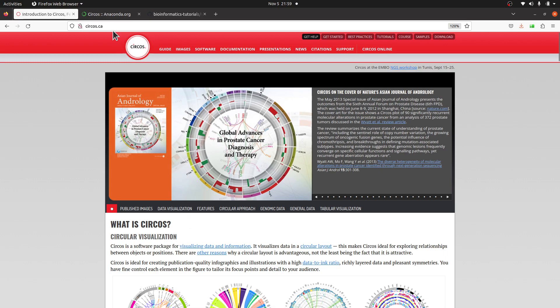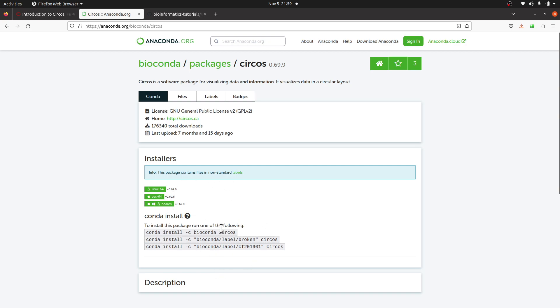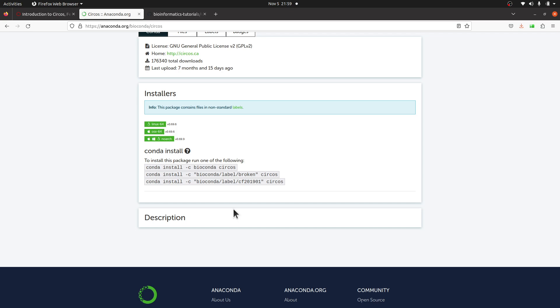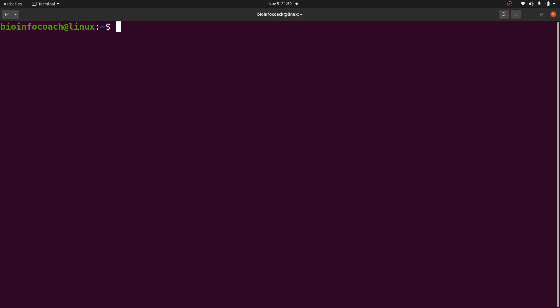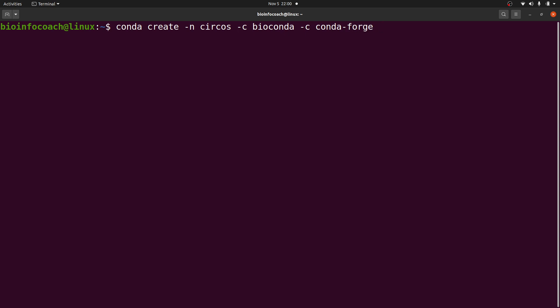Let's move to the instructions for installing. We'll use one of these instructions here. It's very simple and straightforward. Let's go to the terminal and do the installation. I am first going to create an environment and then install Circos in that. So I'll say: conda create -n circos. This is the environment name. I'll add channels: -c bioconda -c conda-forge. Then I will specify the tool I want to install — in this case, Circos.